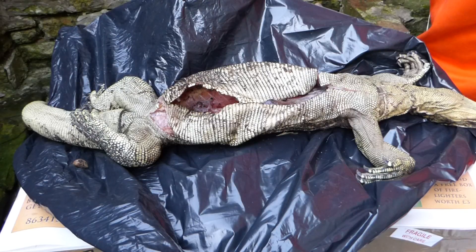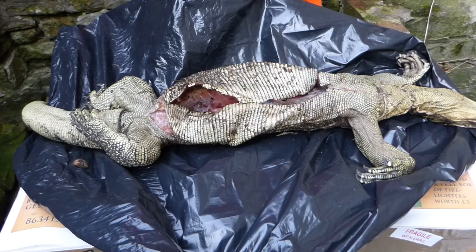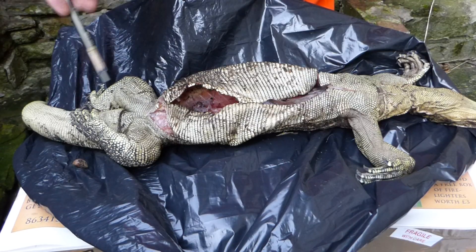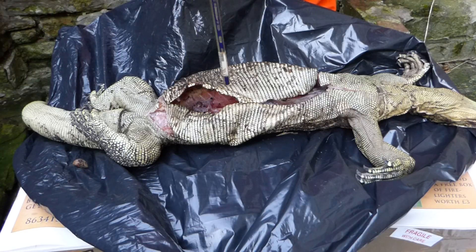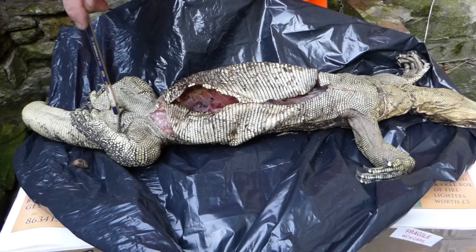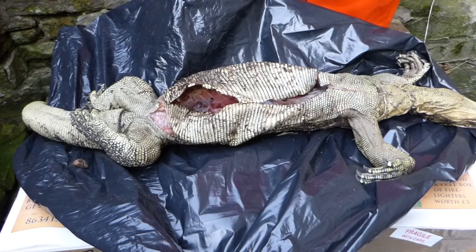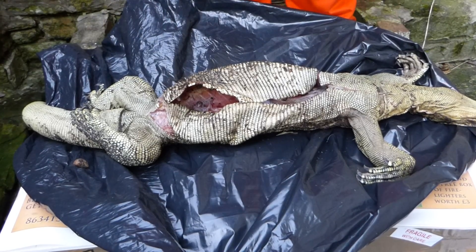Hopefully this Biawak has thawed out a little bit now. The usual way of expressing the proportion of body fat is the number of grams of body fat divided by the snout-vent length in centimetres. For this animal that came out at something like 9.1, which is very high.